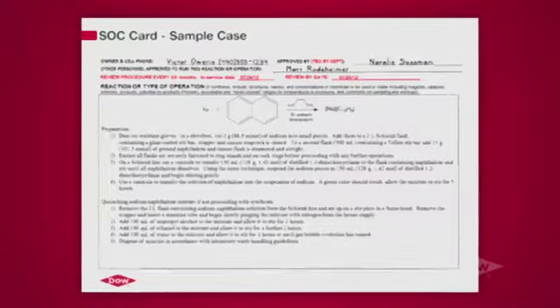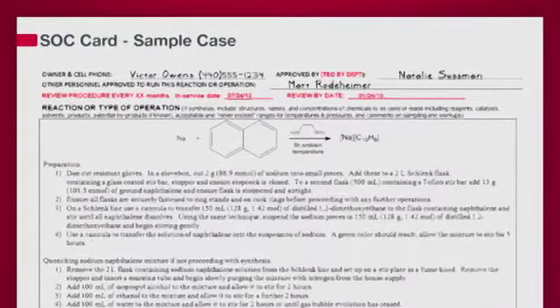Step 1. At the top of the card, you will find a spot for general information. Here you can provide information about the project owner, you, including your name and contact information. With this, your coworkers can easily contact you if they have a question or in the event of an emergency. There is also a spot to list a peer reviewer, if you have one. We'll talk more about this in a moment.